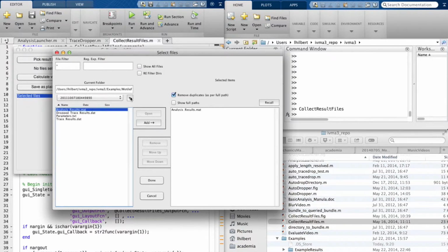Basically you get all the analysis results into this module to work with. One up here, so that we can first determine how exactly we're going to calculate the motile fraction, and then calculate it separately after that for each of the slides.